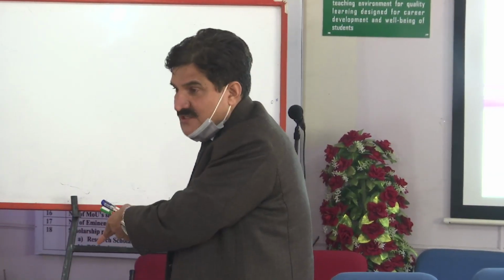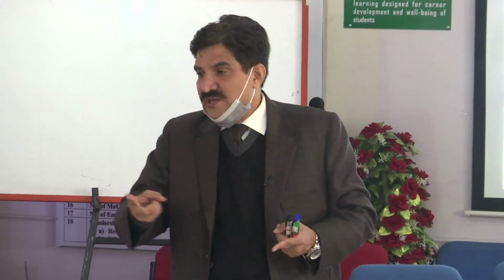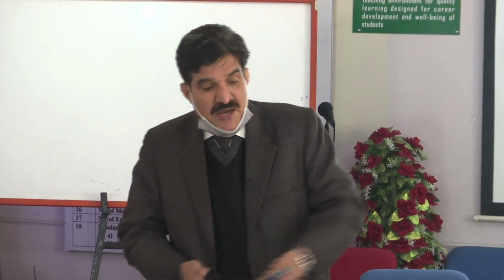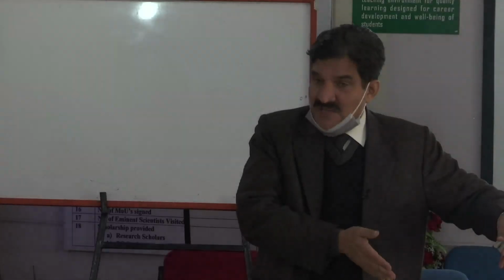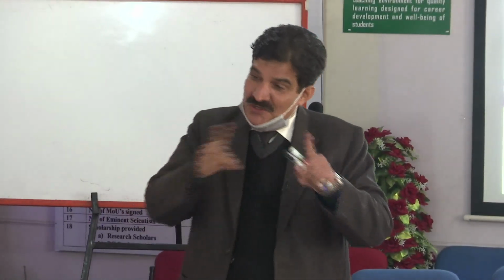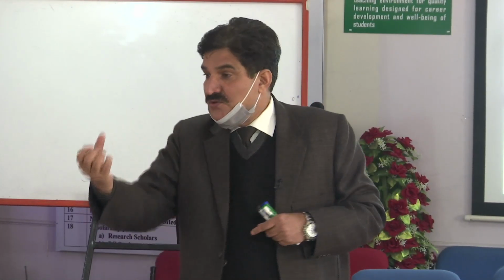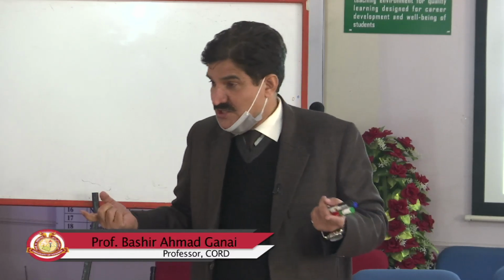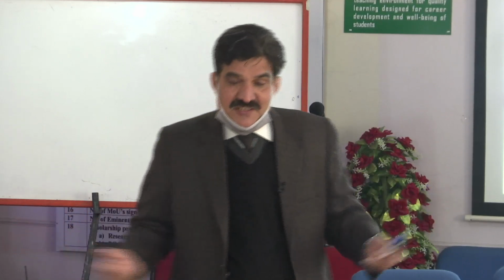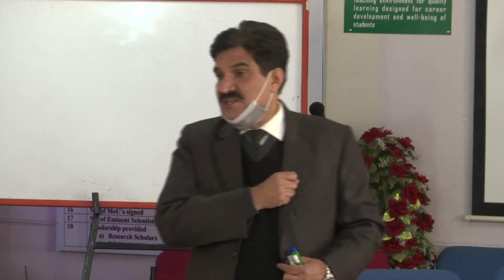So the DNA molecule remains soluble at a particular salt concentration, and at higher concentration sometimes the carbohydrate is in precipitated form. So you are removing it by using this type of detergent, and in a single go it also takes your molecules of choice, nucleic acids, RNA and DNA, because of positive and negative charge interactions. So there is a mechanism for why we use CTAB there.